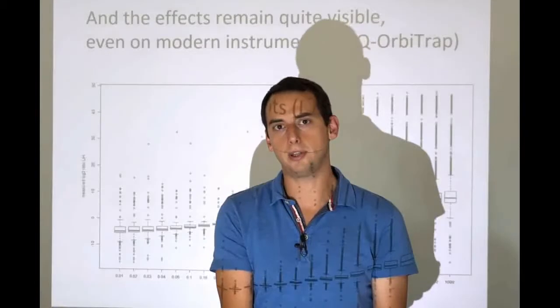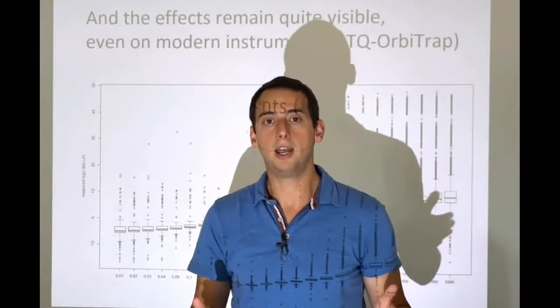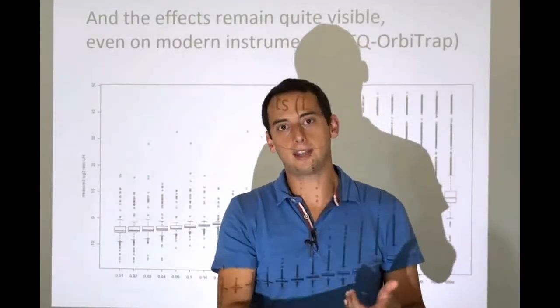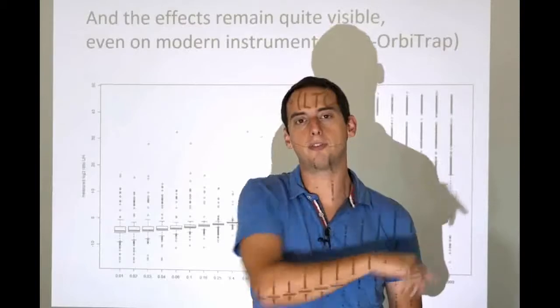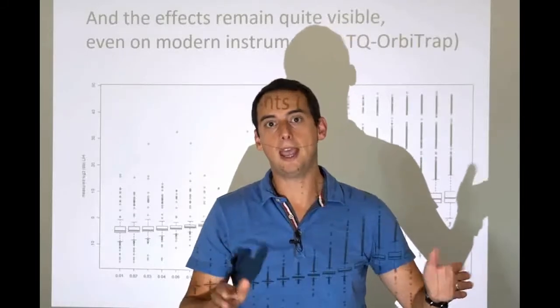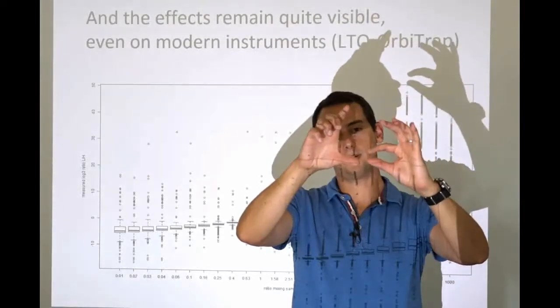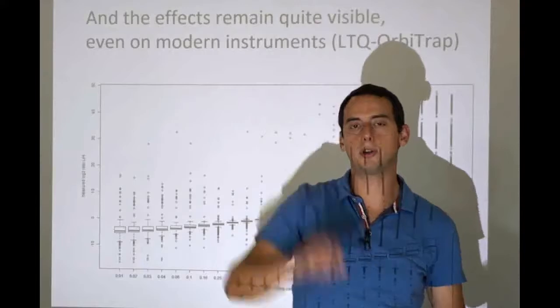You're interested in the amount in the sample. You don't have a clue about what it could be. So what people do is they try a range of options. They spike in our synthetic peptide, which we use to measure the original one, at concentration X, and then 10 times that, 15 times that, 30 times that, and then also 1/10, 1/15, etc. So you just make a range of possible spike-ins, you measure each of them, and you make a series of measurements. So you start off with the sample analyte being much more intense than our spike-in, and then over time this will grow, and then it will start to look like this, and it gives you a complete curve, so you can do a regression on that.